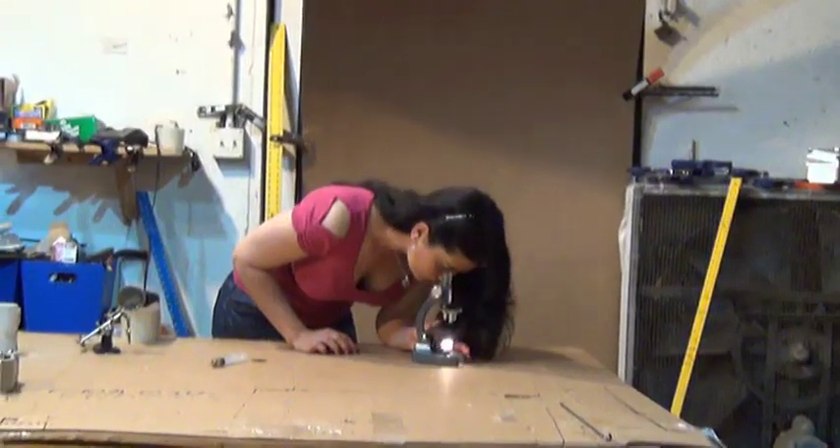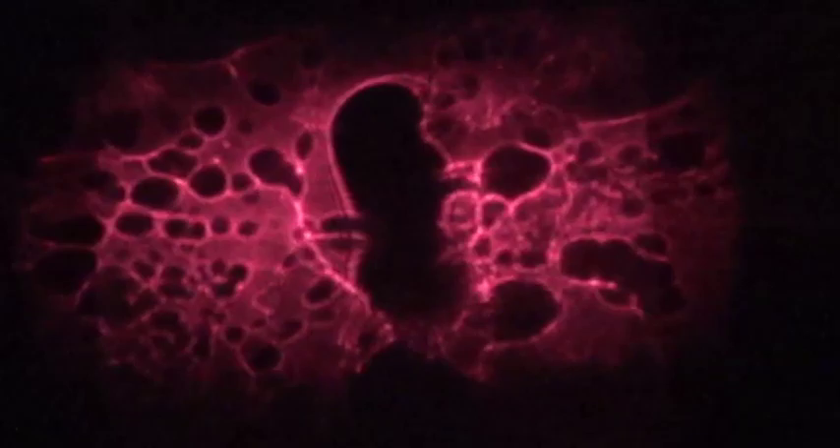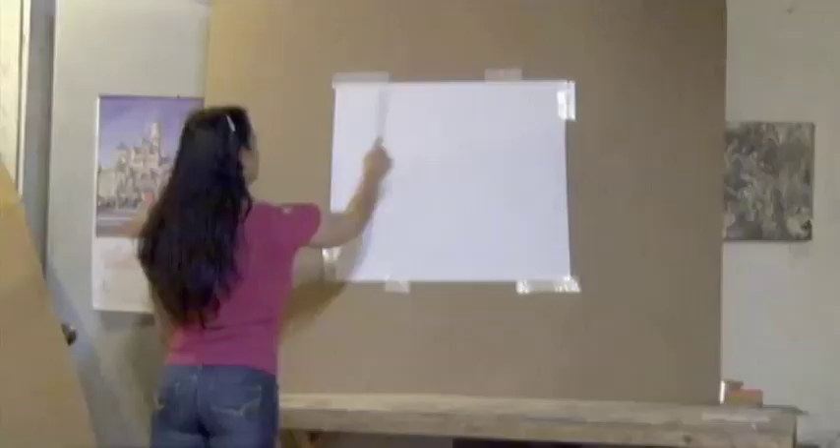Denise enjoys looking at small objects with a backlit microscope, but imagine if she could share those images by projecting them on a paper screen 36 inches across or even larger. These are strands of my hair mounted with a piece of tape to our DIY laser microscope projector. This simple device enlarges the hair strands to almost 4 inches across. The best part is you may already have the needed items to make this projector.